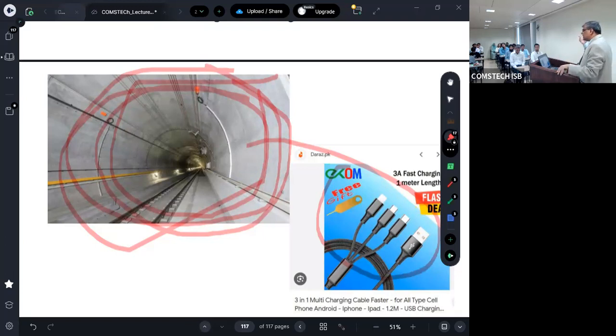Or if you want to check in 1 week, check on day 1 and day 7. If it is stable or only slightly increasing, fine; if it is sharply increasing, don't do this. If it is stable, after 15 days is enough.